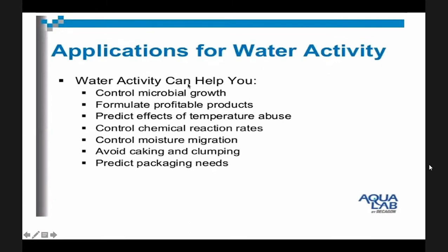Okay. Next, applications for water activity. It can help you control microbial growth, formulate profitable products, predict effects of temperature abuse, and control chemical reaction rates, to prevent further deterioration of some products. So controlling chemical reaction rates is also a factor in formulation. Next, control moisture migration, avoid caking and clumping, predict packaging needs. So see the importance of water activity in industries, especially in biscuits.